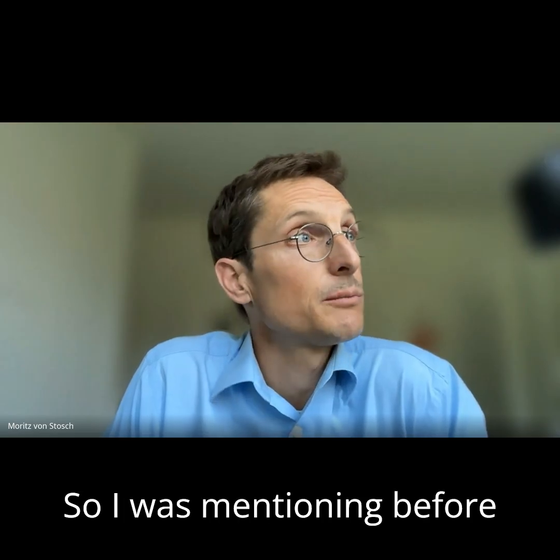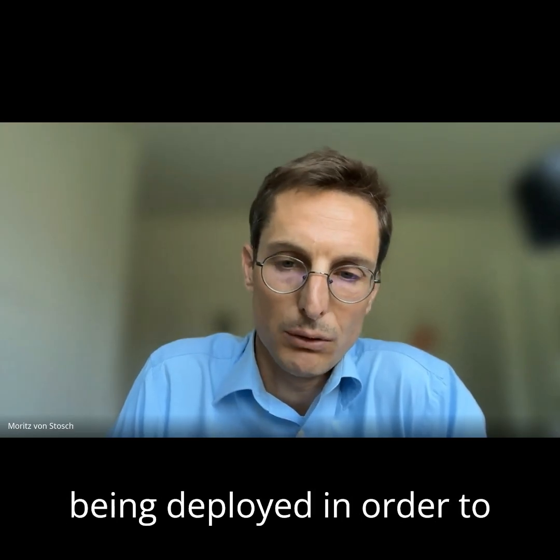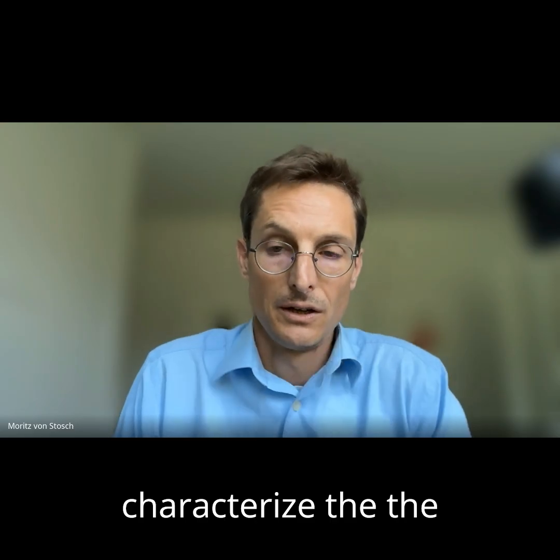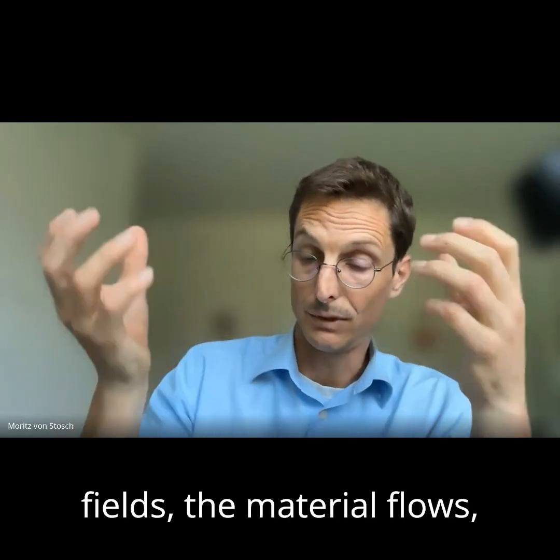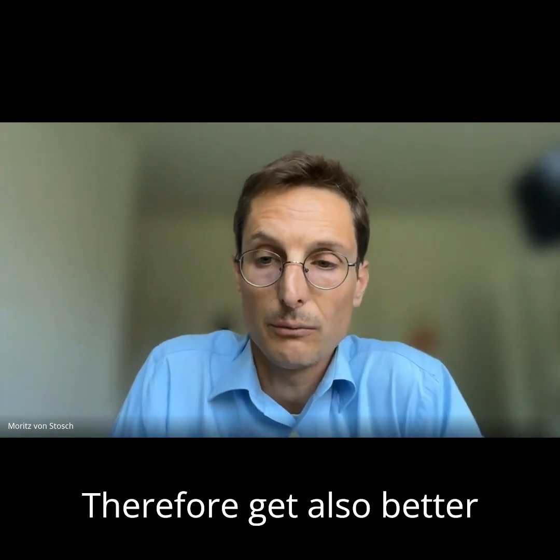So I was mentioning before that there is computational fluid dynamics, for instance, being deployed in order to characterize the fields, the material flows, the transport phenomena in the bioreactors better, and therefore get also better insight.